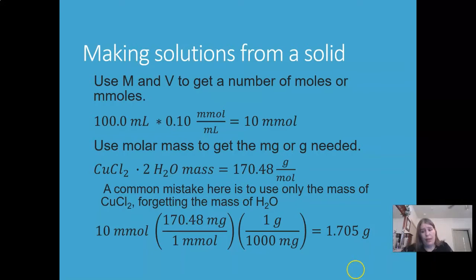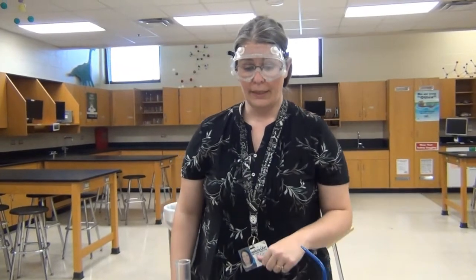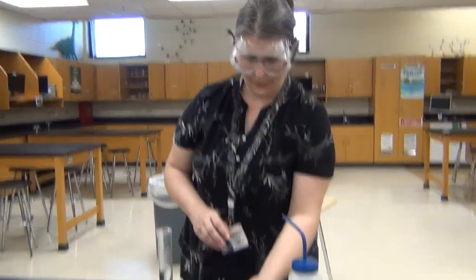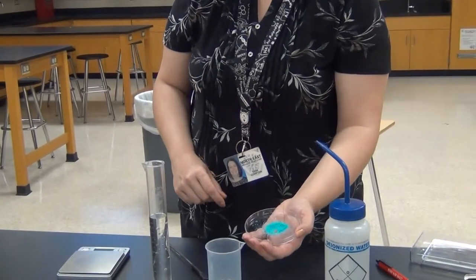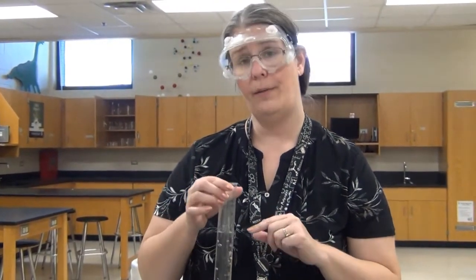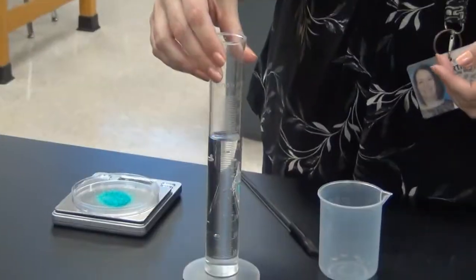Now I've gotten most things ready to start making the solution. You can see I have measured out 1.7 grams of pretty blue copper chloride crystals on the balance. And I've measured out about three quarters of the water here, about 75 milliliters. It doesn't really matter exactly how much because this isn't going to be my final volume. My final volume is going to be 100.